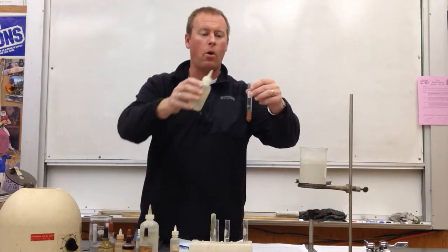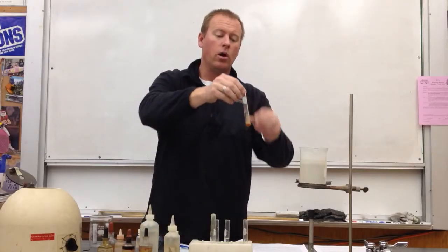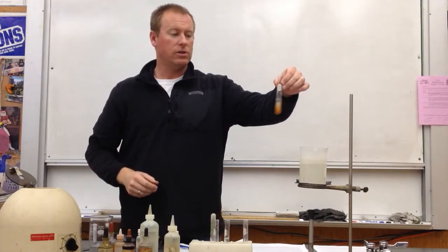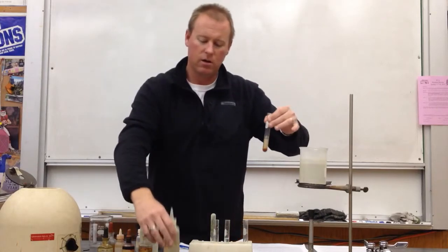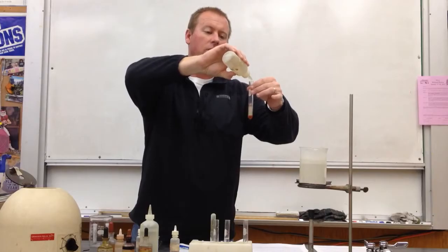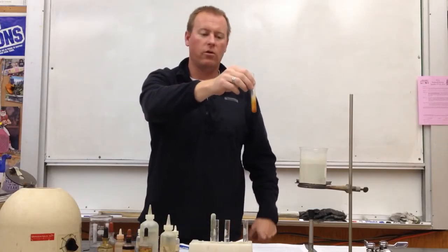Whenever we add things dropwise, we just add a couple drops at a time, and then stir it or shake it real well. In this case, I'm just going to go ahead and shake it. There's not a lot of that precipitate. Remember, it was a rust-colored precipitate that we're trying to dissolve, and there's still a little bit of that rust color there.